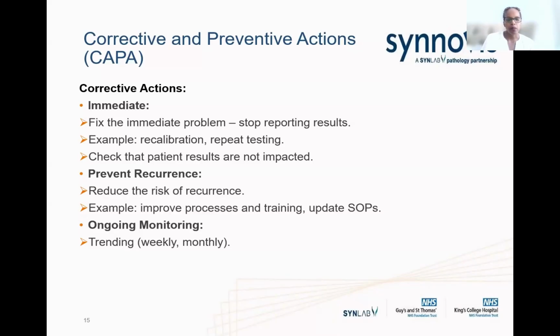And then you have to apply some ongoing monitoring, so trending either weekly and monthly, and then you discuss that data, what it looks like, in your lab meetings, to make sure that the whole lab or team understands exactly what our trends are and how we move forward if there are any issues that we need to resolve or work on.